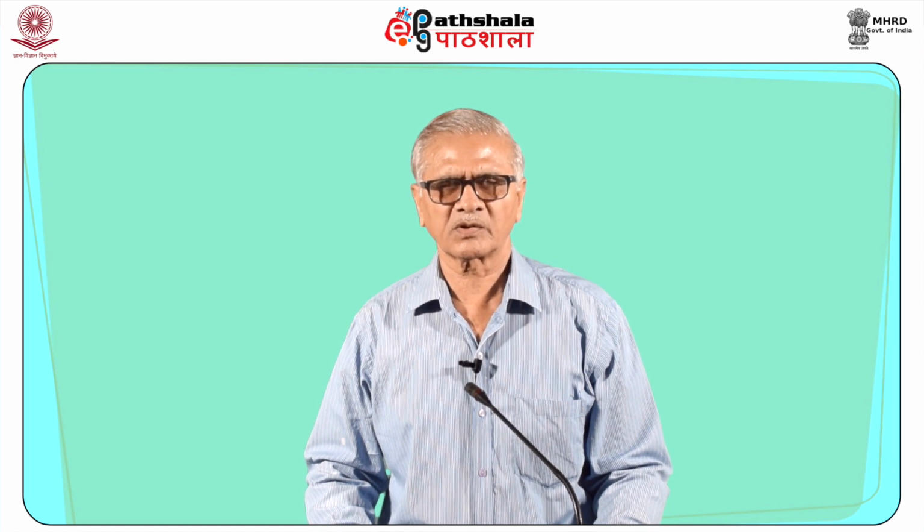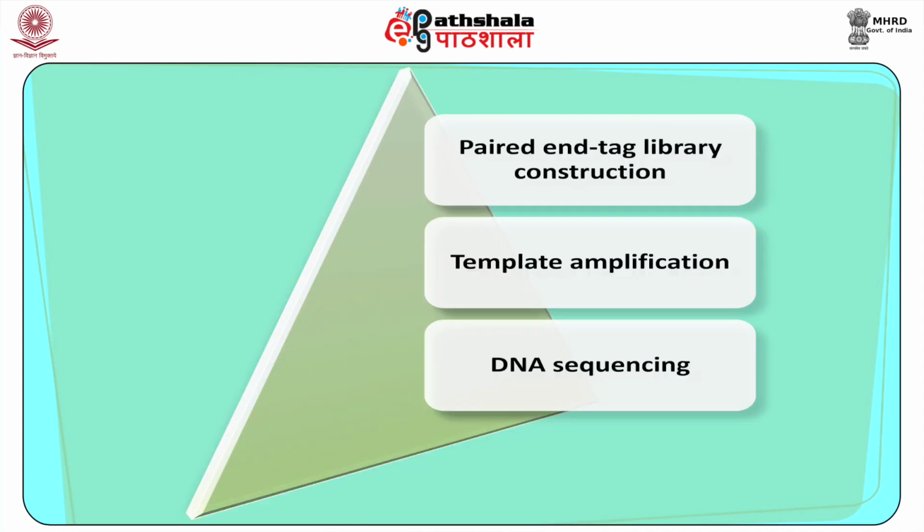The method of Polony sequencing consists of 3 main steps, namely: number 1, paired end tag library construction, number 2, template amplification, and next is DNA sequencing.